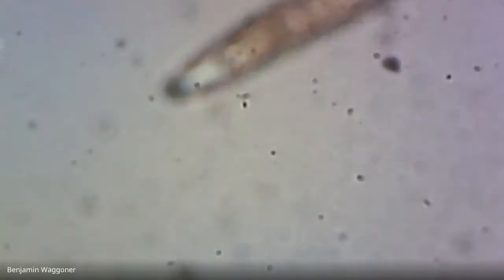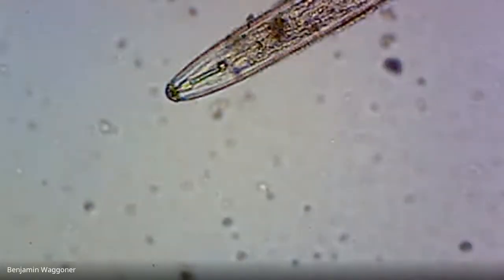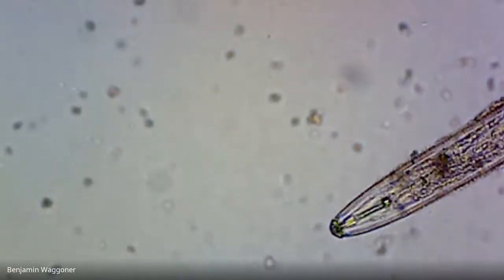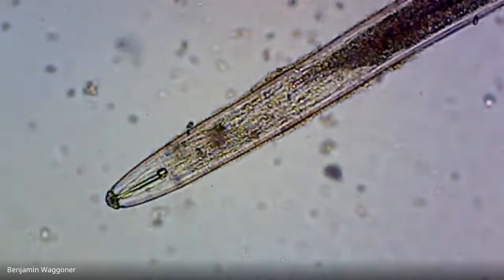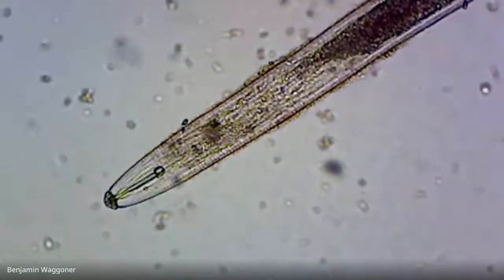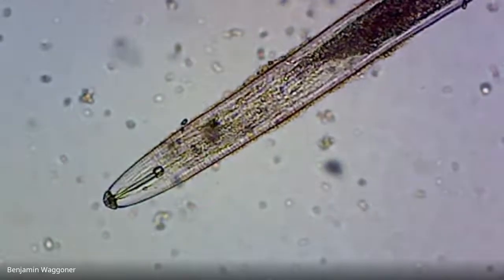All right, I'm actually going to pause and take a quick still picture of this one and put that aside and see if I can save that. And then I'll make another wet mount because I think we only got 5 or 6 there.